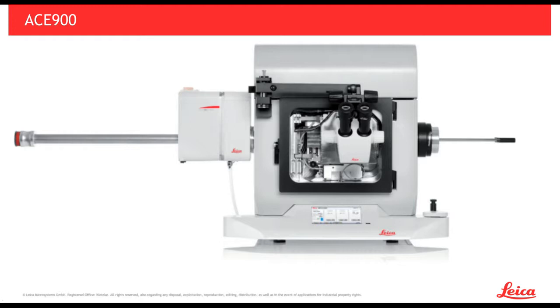I guess I can start with this and then hand it off to Seth. So the crystalline formation of platinum is inherent in all platinum carbon replicas. It's just not normally imaged because you need a very high magnification to see it. Most of those replicas were actually made on a Balzer type freeze fracture machine, so probably closer to something John Rash is using.